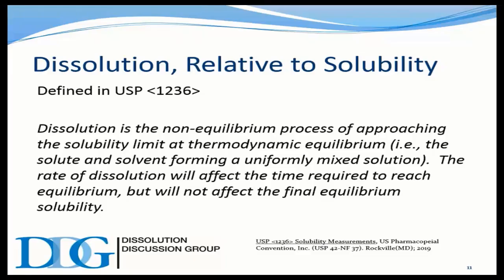So when we're talking about thermodynamic equilibrium, we're not looking as much at rate, but more on extent. So dissolution is a process for determining the rate and the extent of that amount of drug that's going into solution. So today, we're not as much focusing on the rate as we are the extent.